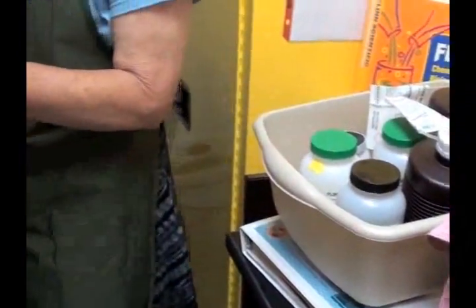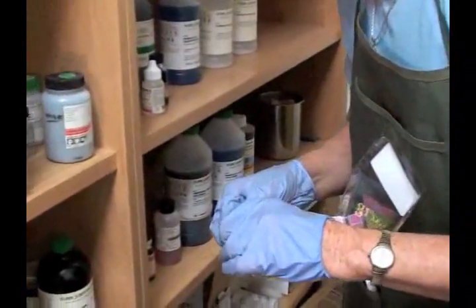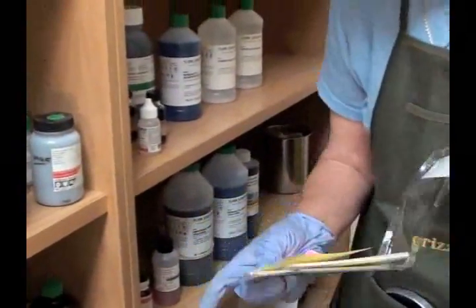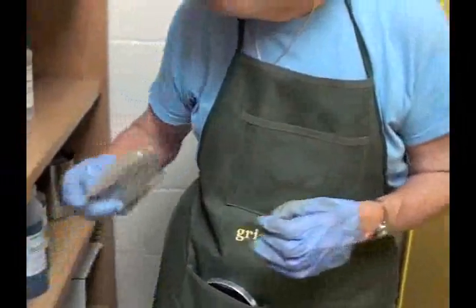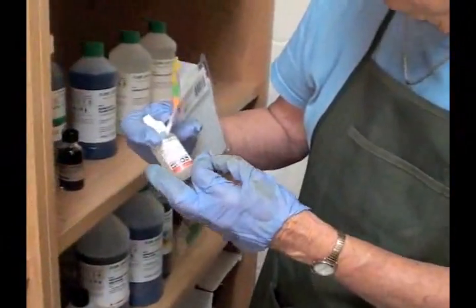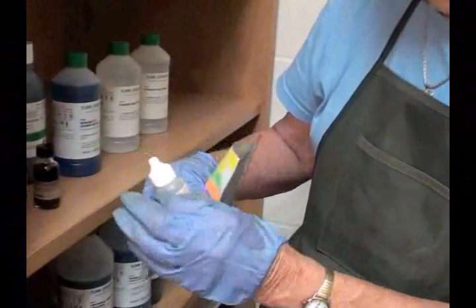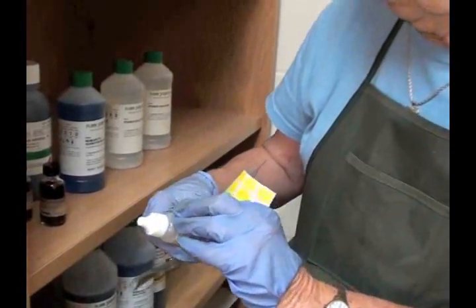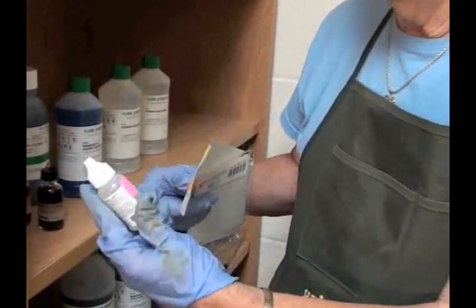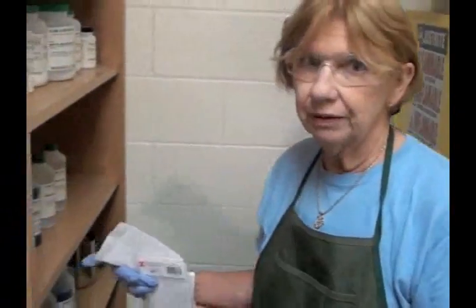And then red, or shocking pink is as close as I could get, for flammable materials. See, oh, here's this little bitty container of phenolphthalein that is flammable. See, it's got the red there, but you just want to see it really well. Just put it on there so that when you're putting things back where they belong, you put them back where they belong.